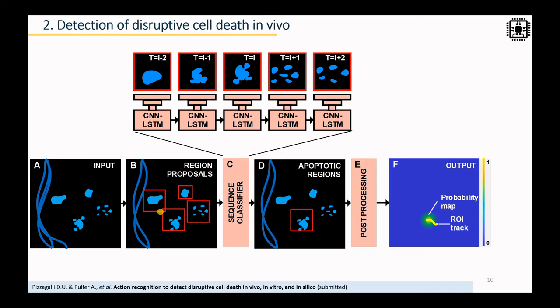We wanted to do another step and detect cellular actions relying on deep learning without the need of tracking the cells and by looking at the cell morphology over time. For this reason, we started to train a ConvLSTM architecture to detect a specific type of cell death which yields the disruption of the membrane into pieces, like for instance apoptosis.